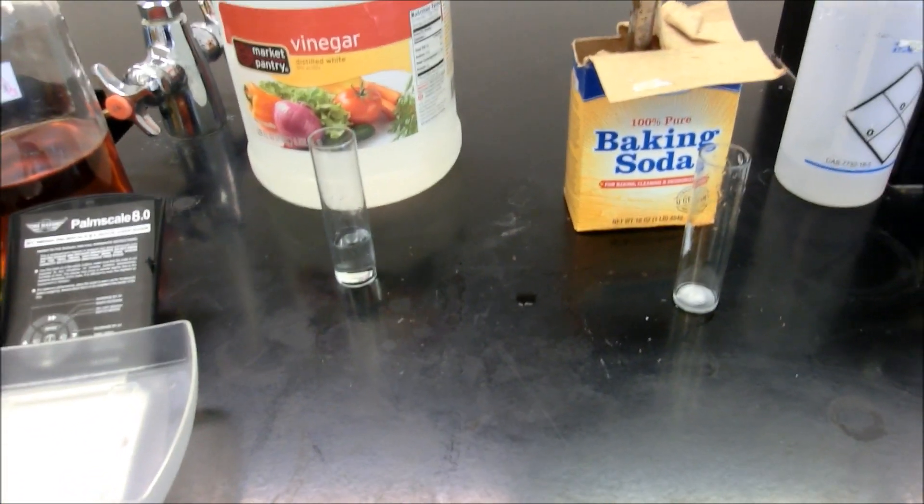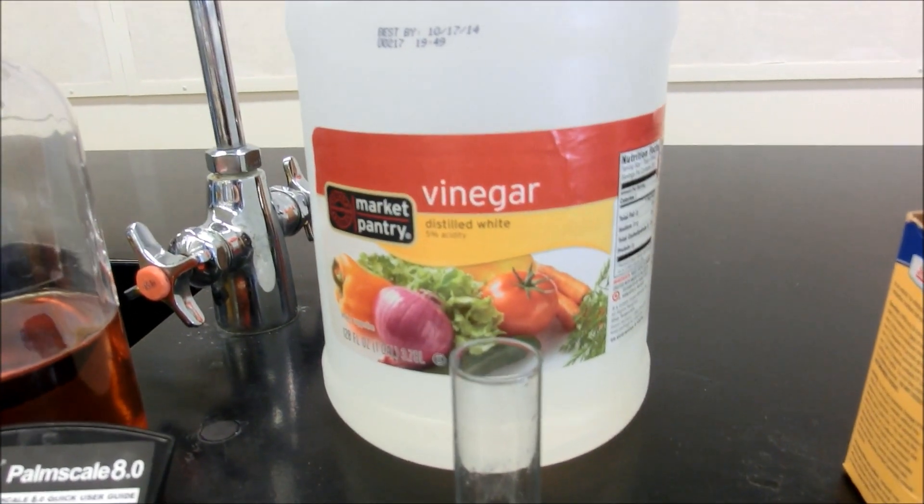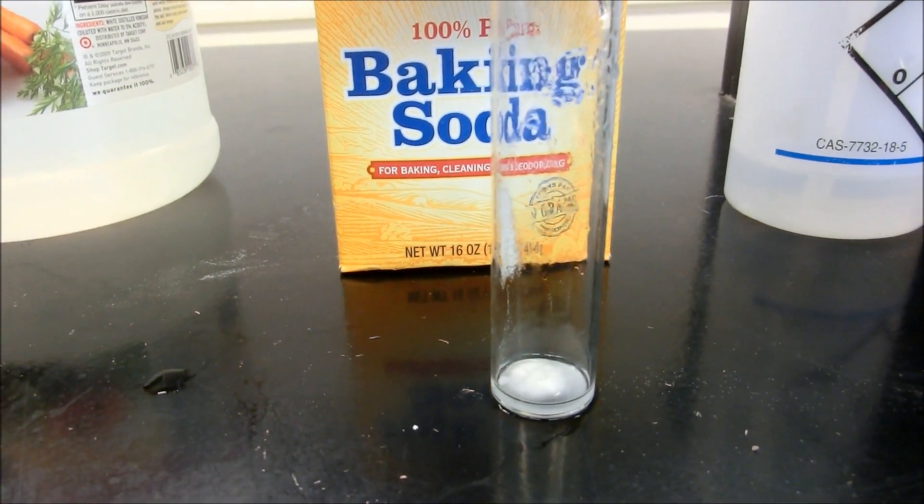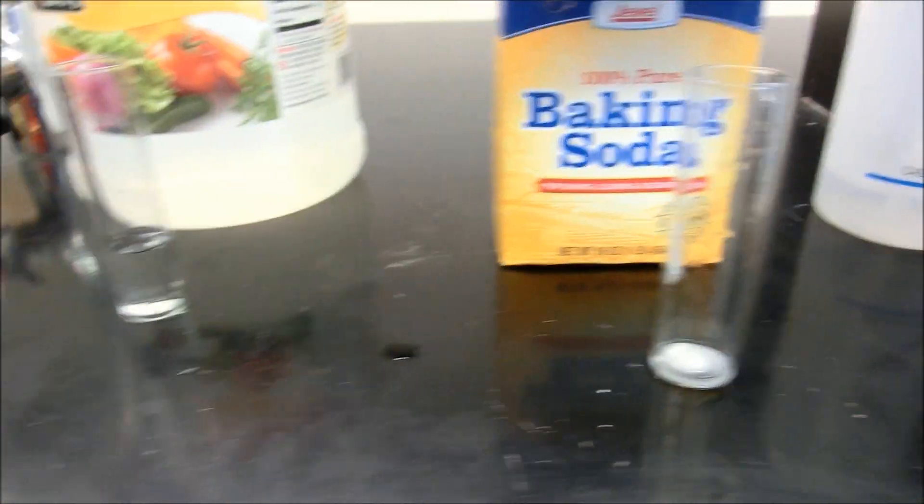So we've got baking soda and vinegar. There's the vinegar. There it's poured out. By the way, we call that hydrogen acetate as well. The sodium bicarbonate is also called baking soda, if you're wondering where those came from.